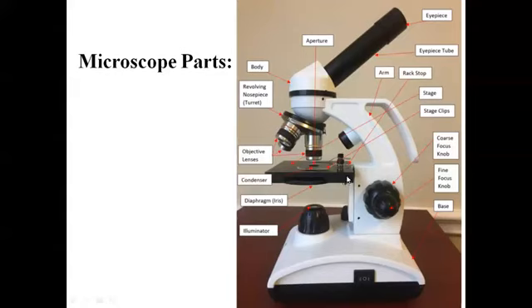Once you move the stage up or down, the calibration will be done. Whether the focus of the sample that you are viewing through the eyepiece is clear or unclear can be adjusted with your coarse knob. Then what is the fine knob doing? Once you have set your focus with the coarse knob, that means from the eyepiece you are able to see the sample clearly.